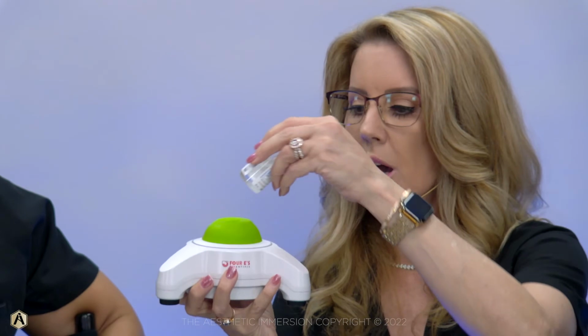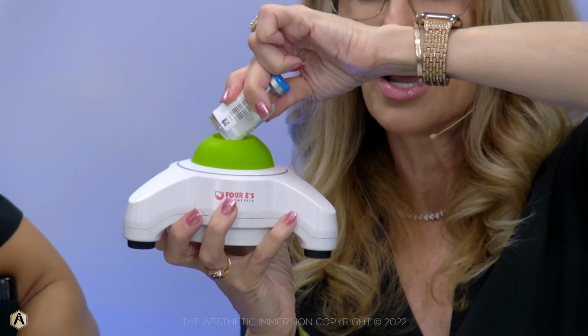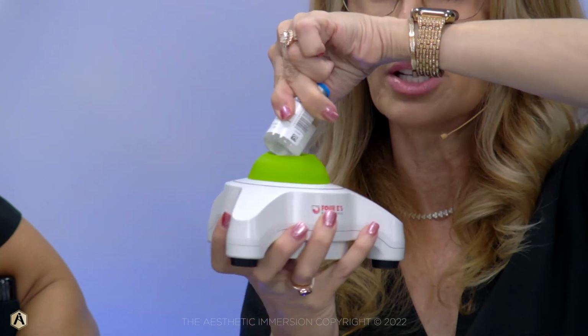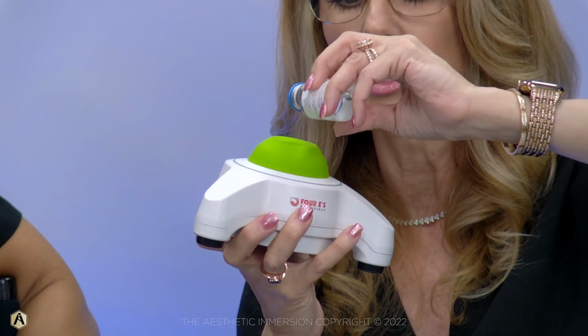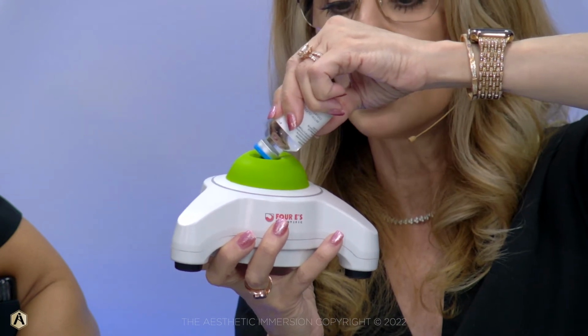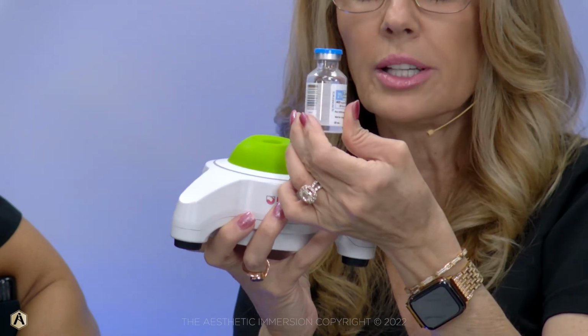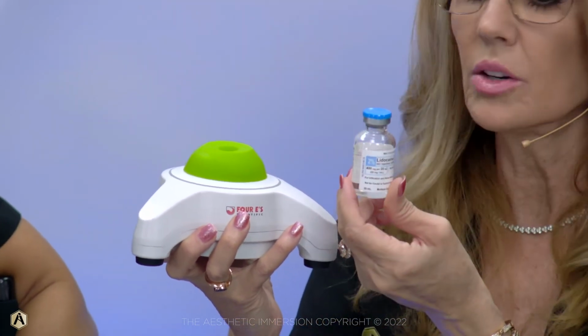So this says 4Es. This happens to be the brand I got, but it doesn't matter what brand. But this is a Vortex. So when you are mixing your Sculptra or you want to mix your product, I will put the vial down, and it's not plugged in now, but I will push down on the vial and it spins it at about 8,500 RPM. And then I will turn the vial around, because there's usually a rubber stopper with a little notch cut out of it, and I will spin it this way. And I will spin my Sculptra until it gets totally milky and the particles are broken down, and then I can put the rest of my water in there and use it to inject.